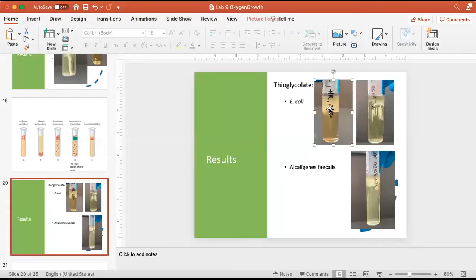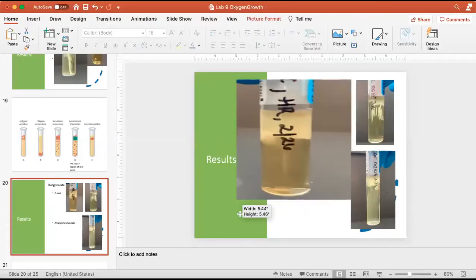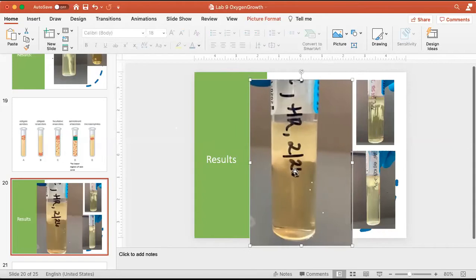Brianna, let's take a look at E. coli again. This one sure looks like it might be just the oxic zone, right? But this string right here, that's real. There are cells hanging down from that area, growing down into the lower parts of the tube. So it's really happy in the oxic zone, growing really well there.